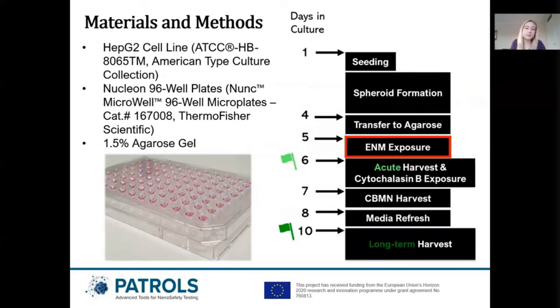So in preparation to build this model, there are a few key components you'll need to bear in mind. This model is based on the HepG2 cell line from ATCC, and if you're looking to do a genotoxicity-based study within this model, I advise that you run a preliminary experiment on the cell line first to assess the background genotox prior to then diving into your research, as some supplier stocks do have a higher background than others.